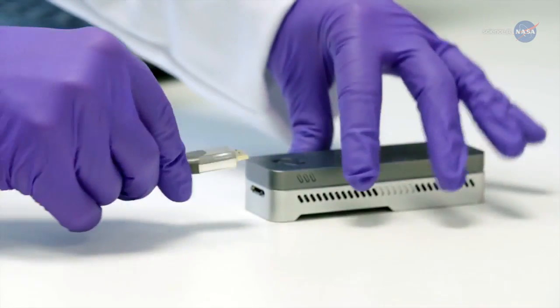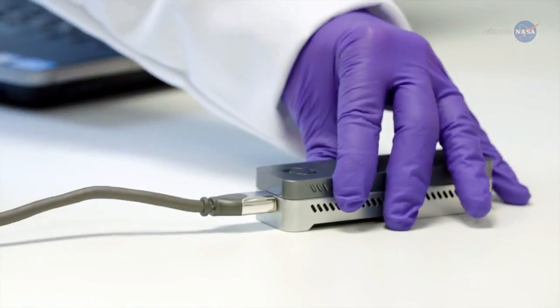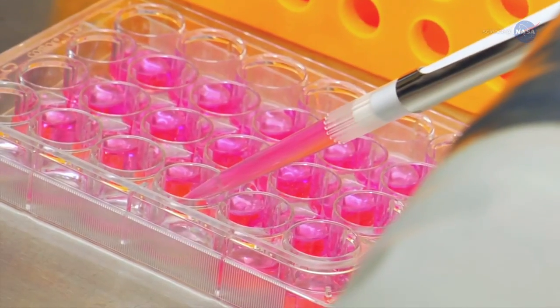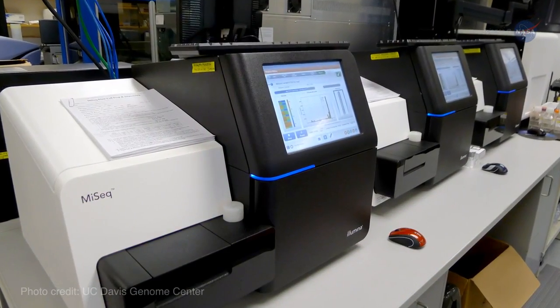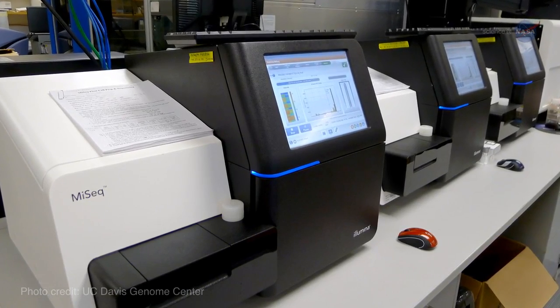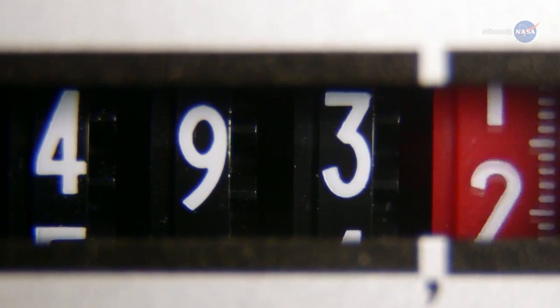The USB-powered sequencer, about the size of a small candy bar, is tiny compared to the large microwave-sized sequencers used on Earth. Castro-Wallace says most sequencers in Earth-based labs involve optics, fluorescence, lasers, and other vibration-sensitive components that are not suited for spaceflight or microgravity. "There is huge power consumption at play with those as well."